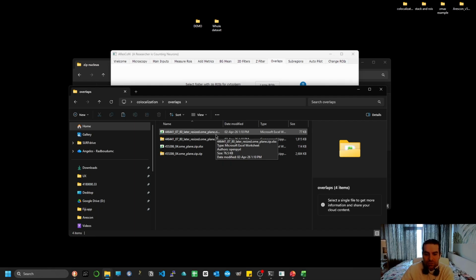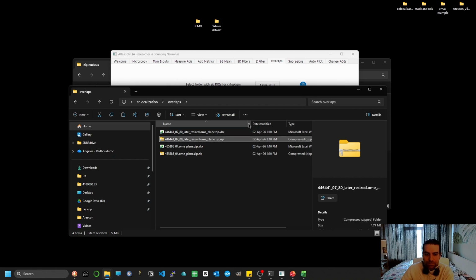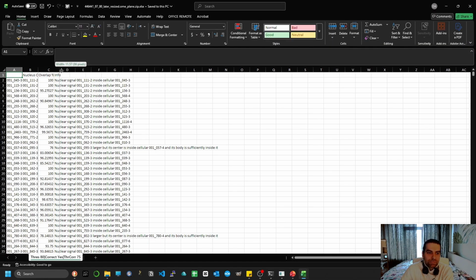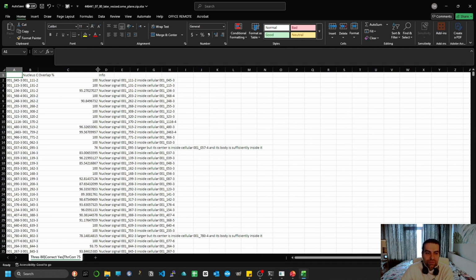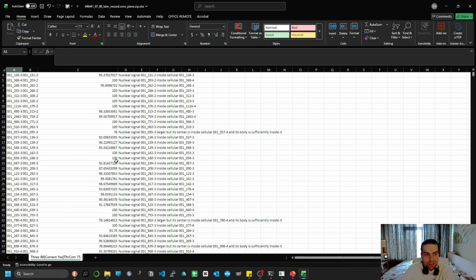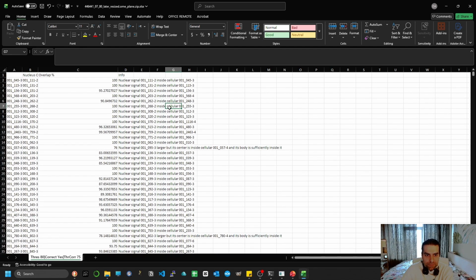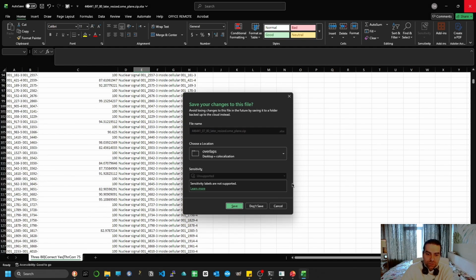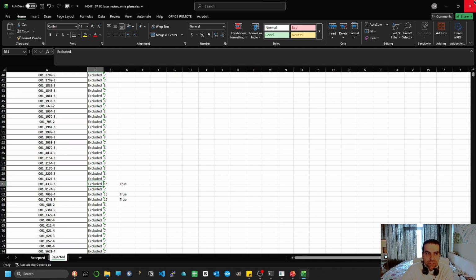But you have the final regions of interest in zip format. So all your final files that you want to have, right? If you're looking for reactivation rate, for instance. And you can also see, again, the logging file, and you can see the threshold that you used, if you wanted to correct, and what threshold you put for the correction. And you can see the percentage of the overlap and which neuron they were overlapping with. A bit more detailed here, but still useful if you want to go through some things.